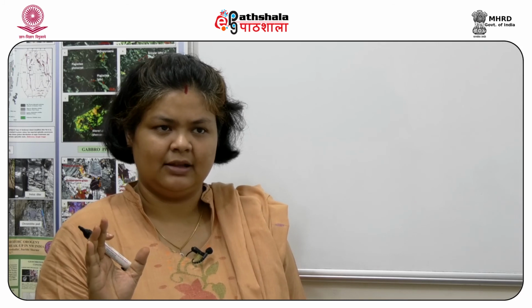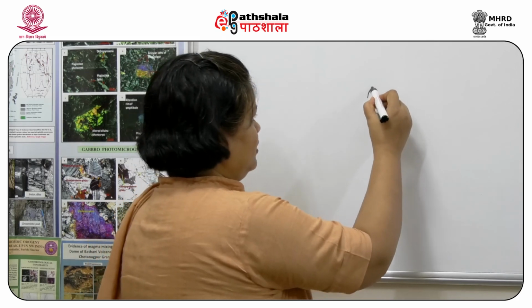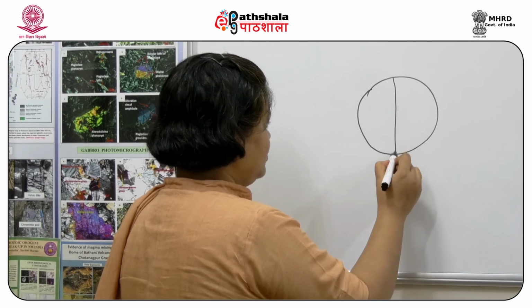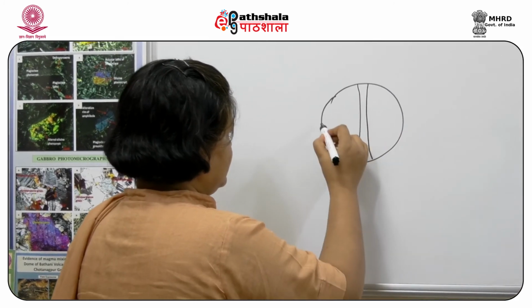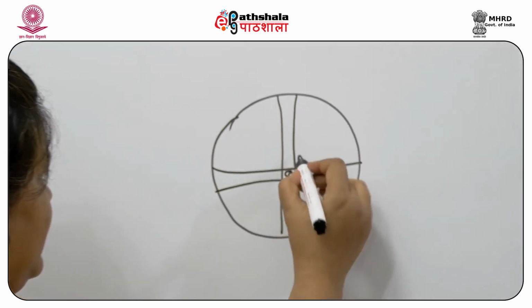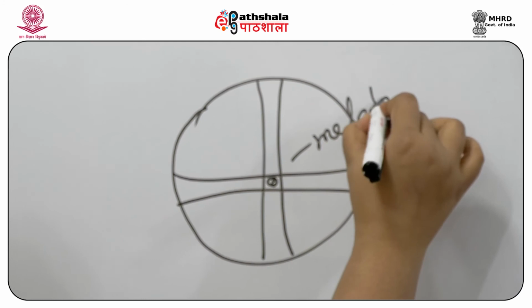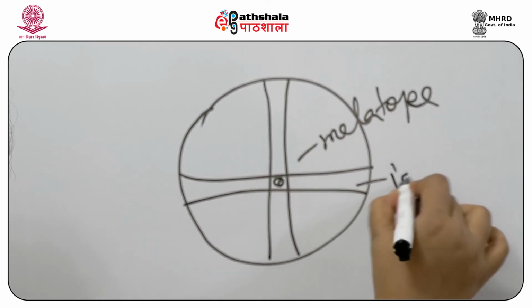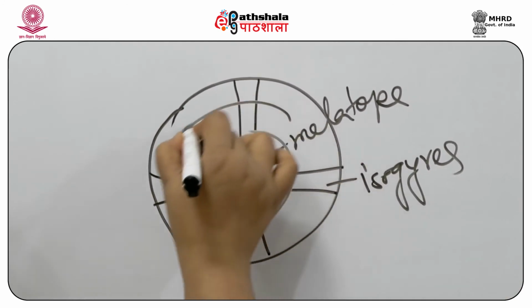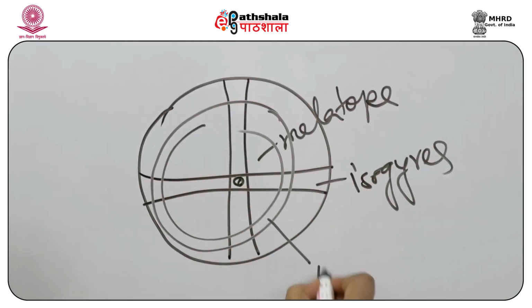Here I will show you in brief in two diagrams the basic difference between an optic axis uniaxial figure and a biaxial figure. Here we have a uniaxial interference figure wherein we have two isogyres which are constant. Here we have the melatope. These are the isogyres. And here we have the concentric colored rings, which we call the isochromes.